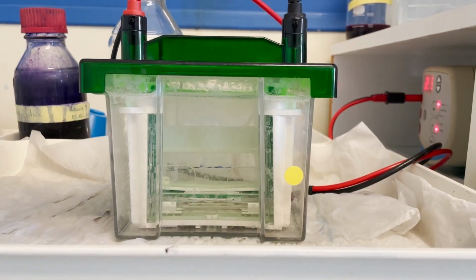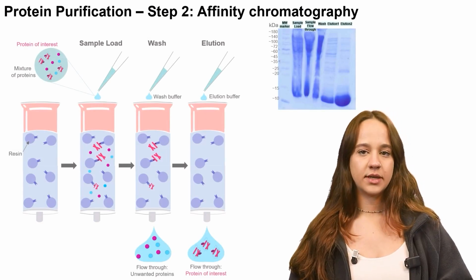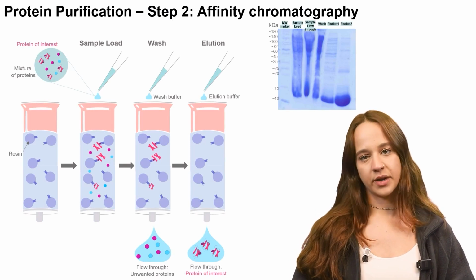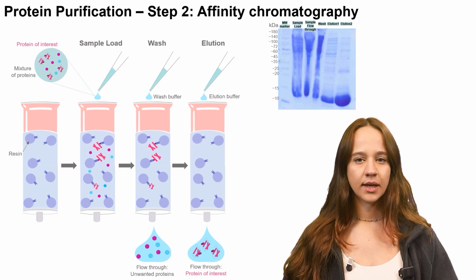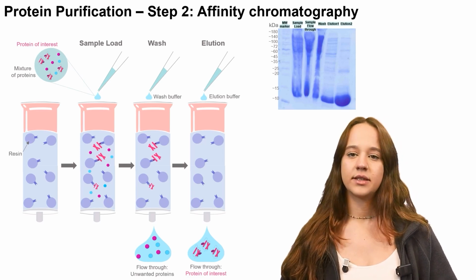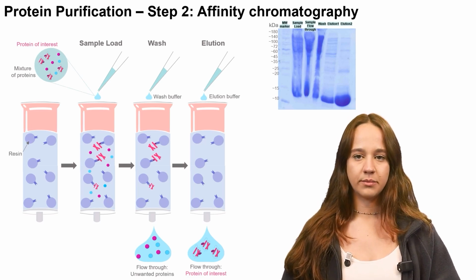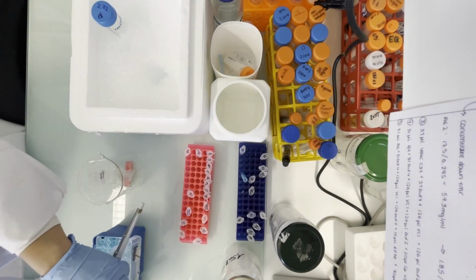The success of the purification is then evaluated by SDS-PAGE analysis of all the samples and fractions collected during the procedure. As seen here with a recombinant protein of 13 kilodaltons, the protein is present in the supernatant following sonication and centrifugation. And after affinity chromatography on the nickel column, it is recovered in the elution fractions as a much purer sample than in the beginning.